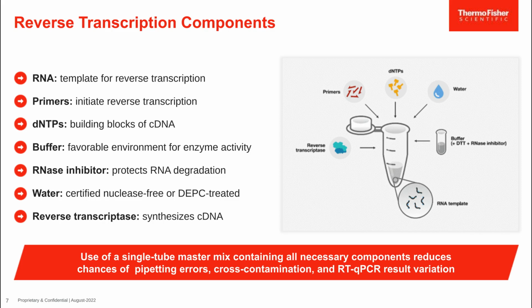So, to help minimize these errors, for RT-qPCR in particular, it is highly, highly recommended to use a master mix that contains all the cDNA synthesis reaction components in a pre-mixed format. Not only will this reduce the variation in your experiment, but it will also reduce the chance for contamination in addition to saving you time.